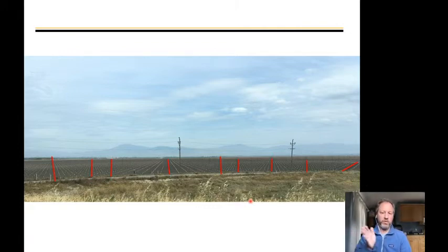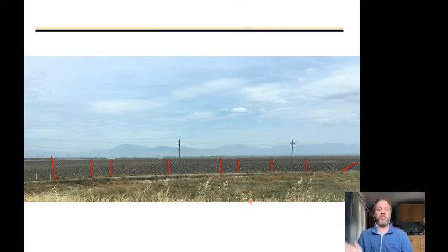So the X-rays will diffract off these planes, and there's different orientations of those planes through the 3-dimensional lattice. And so you get constructive interference at different angles because of the construction of these different planes. So we bounce off this plane in one angle, this plane is a different angle, this plane is a different angle. So we get different diffraction peaks.